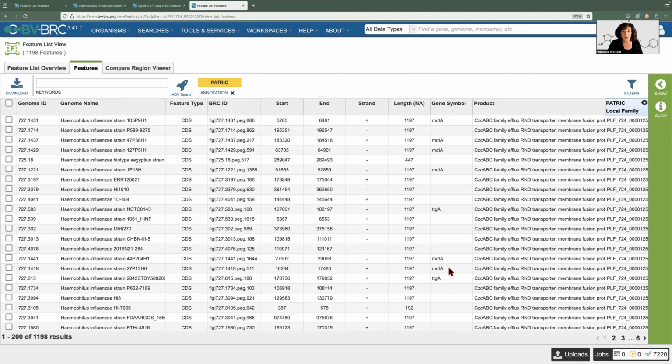They all have the same name. And some of them are called different things. And in literature, the names evolve from the old papers. So this is often a really hard thing for people to do that are looking at an older paper and then what's the name of the gene now? What are people calling it? Where can I find it? Sometimes you're going to have to do BLAST to find it, but this is a technique you can use.